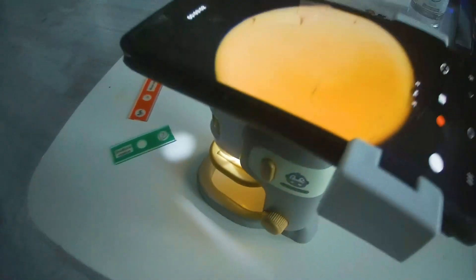Alright, so this is a kid's microscope. It's a great introduction to science. It has 60 to 180x zoom, and here's how it works. It's basically like a little plastic, but the crazy thing is this thing does actually operate like a real microscope.